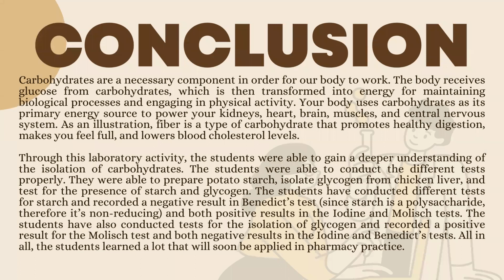And also, the students conducted different tests for starch and recorded a negative result in the Benedict's test since starch is a polysaccharide, therefore it is non-reducing, and positive results in the iodine and Molisch tests. Lastly, the students also conducted tests for the isolation of glycogen and recorded a positive result for the Molisch test and negative results in the iodine and Benedict's tests.